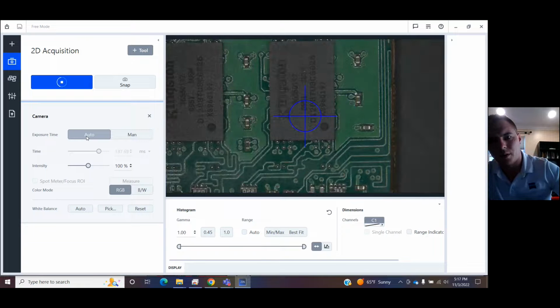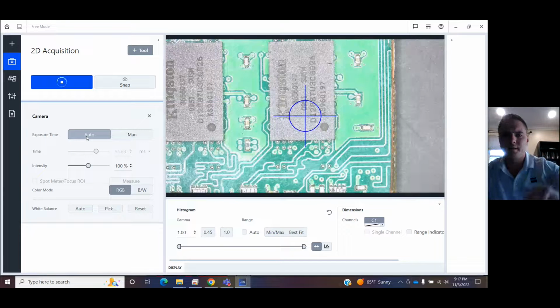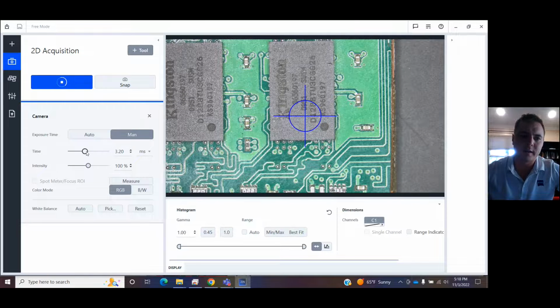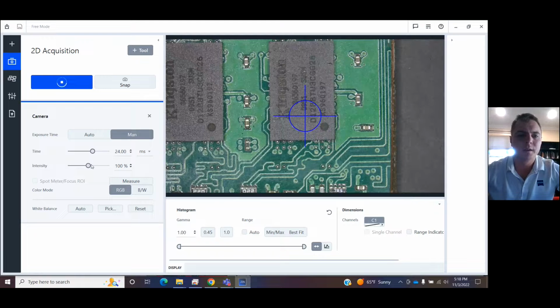available, the camera will automatically adjust. Just like that. I can bring it back up now and it will adjust again. If we don't like auto exposure, we can turn on manual exposure. I can change the rate at which the camera is refreshing. It's up to you. You can change the relative intensity in auto exposure if you want things to be darker or brighter in general. We'll keep it at 100% the default for now.